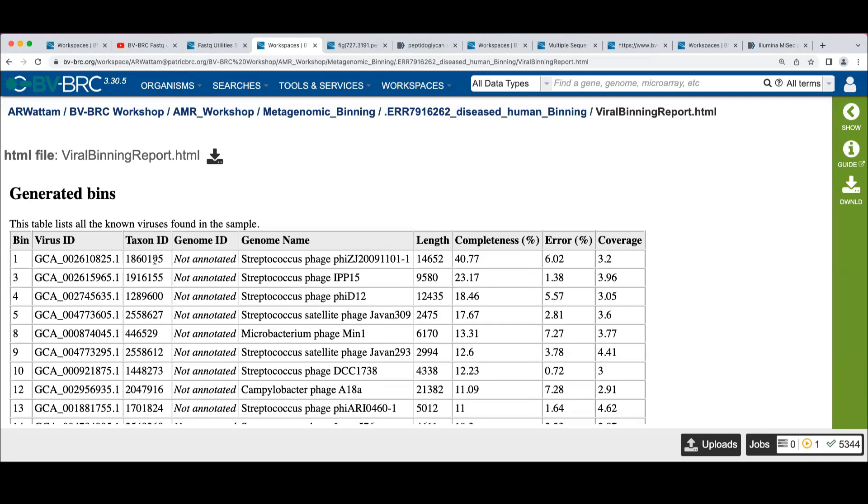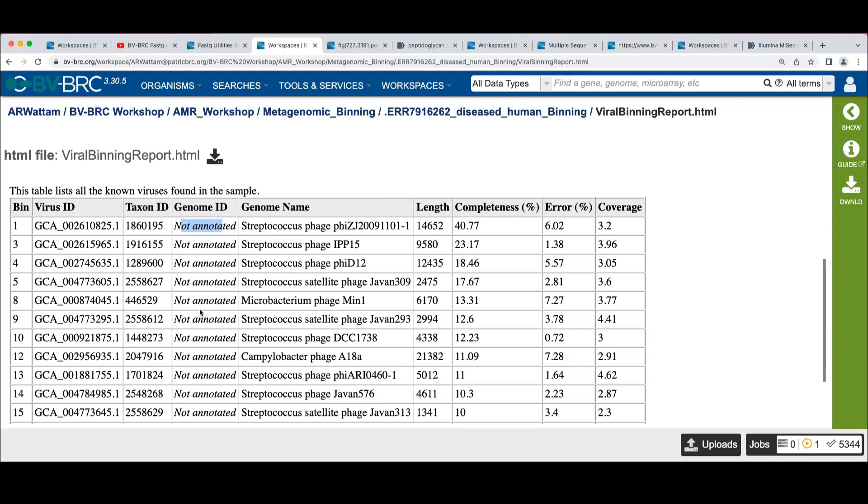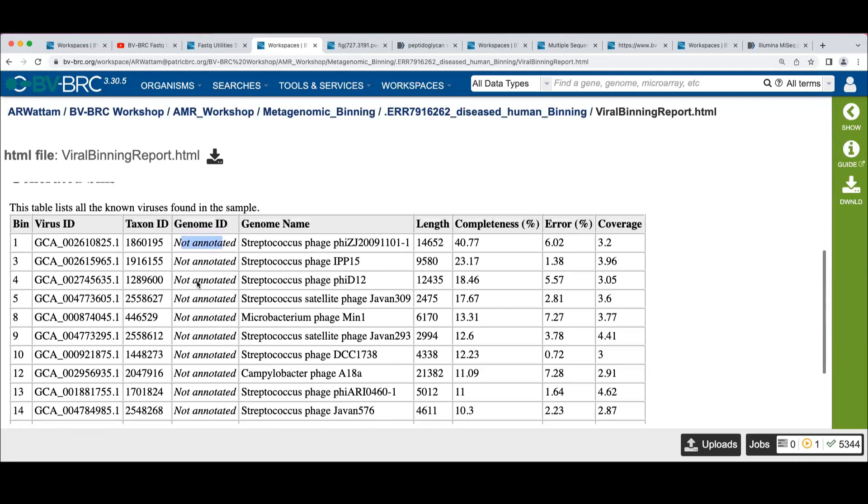For each of the hits we get, we get an identifier for the virus, the taxon ID, name of it, and some statistics. And we see this not annotated non-link that if we were able to annotate the virus using the BVBRC viral annotation, we'd see a link to that annotated virus, but because we can't annotate, we don't pollute the database with unannotated viruses.